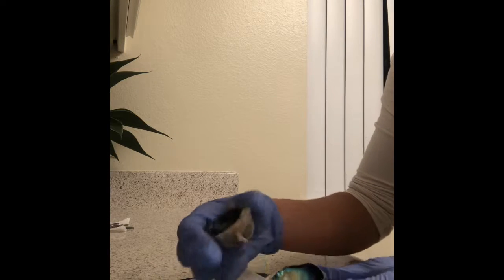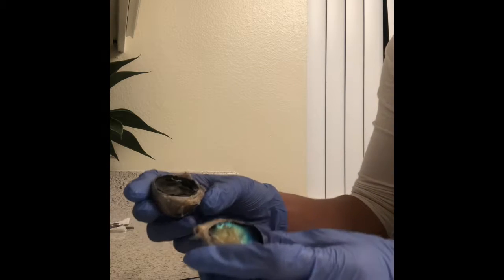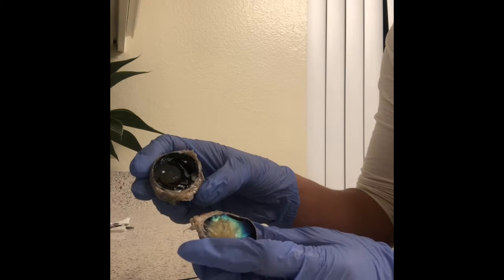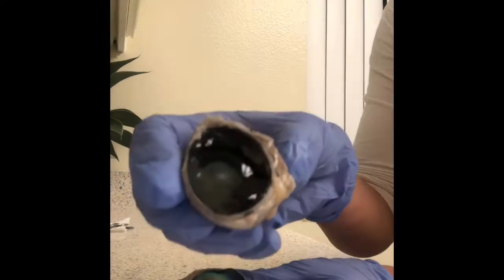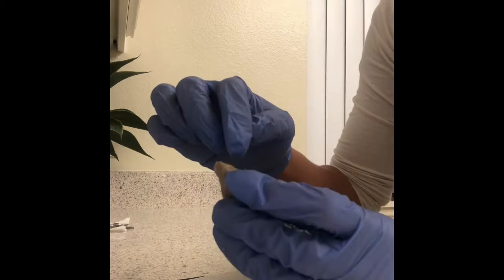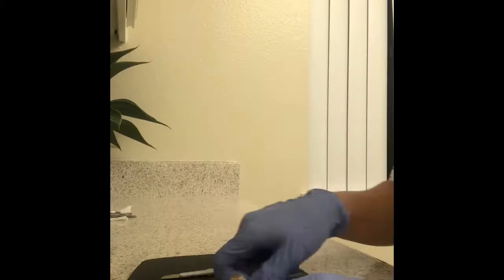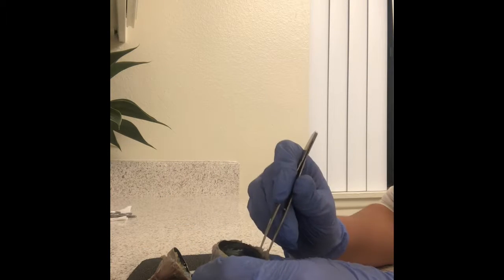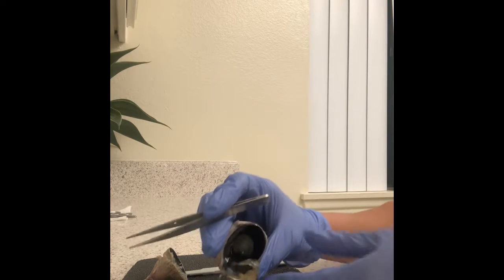Okay, so we have cut the eye into anterior and posterior portions. So we see the gelatinous mass inside the eye, and that's vitreous humor or vitreous body. So if you look here, you can see that. And then in this one, it's pretty cool because I didn't know inside the eye there was this. I'm going to remove the vitreous body with forceps just by pulling it gently. Okay, and there it comes out.